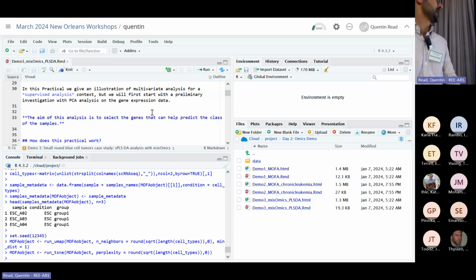So basically, a good way to start is to do PCA as a first step, because it's quick to run and gives you an idea of the data. It is unsupervised; it does not include the outcomes. And then we're going to do our supervised partial least squares discriminant analysis to find dimensions of the data that not only explain variation across the genes, but also variation in the outcome, the classes, what type of cancer people have.